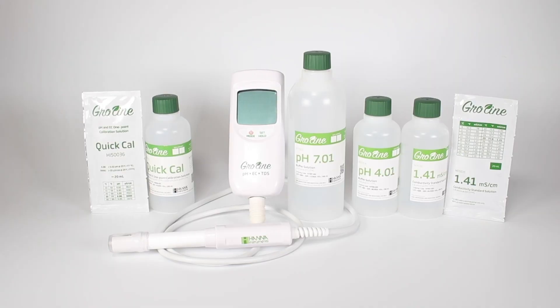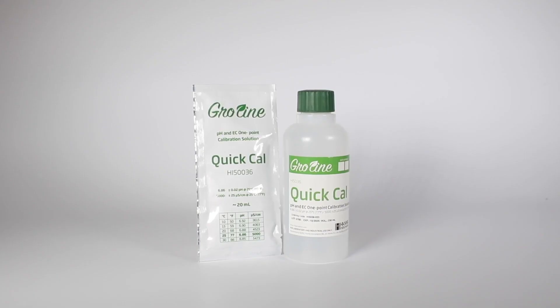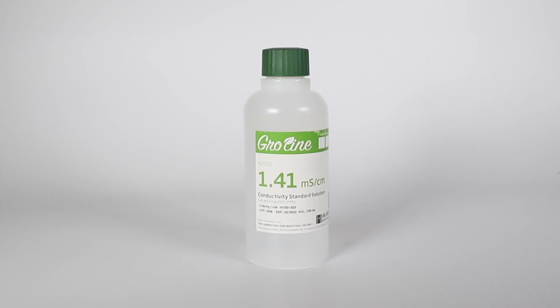In this video we'll be showing you how to calibrate your HI-9814 growline meter using three different calibration types. First we're going to do a quick cal calibration using our own pH and EC one point calibration solution. Then we're going to do a standard calibration using pH 7 and 4 buffer solutions. And lastly we'll be doing an EC calibration using your 1.41 millisiemens conductivity standard solution. Let's get started.